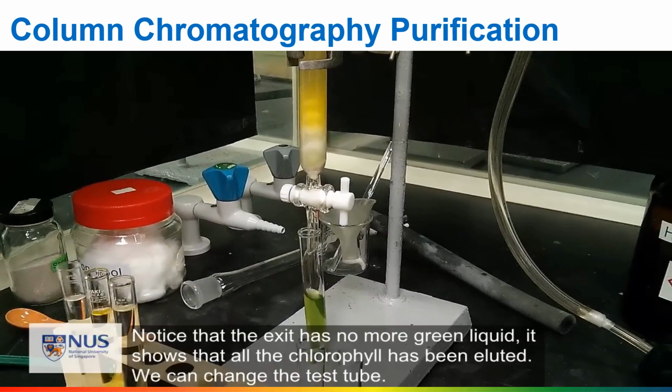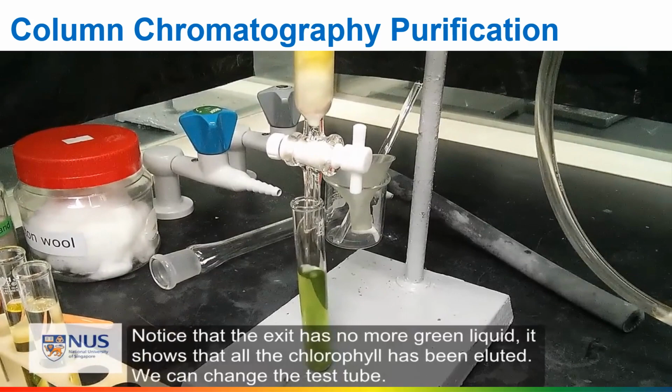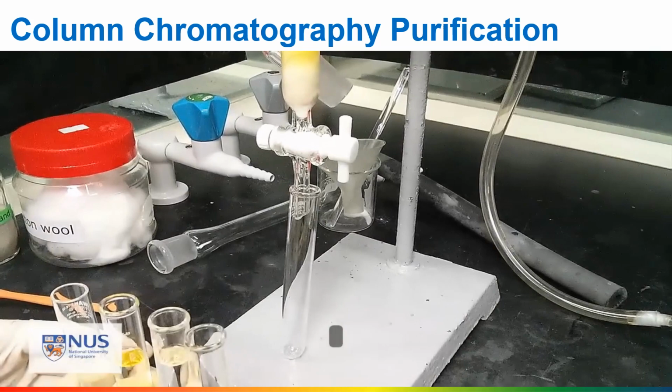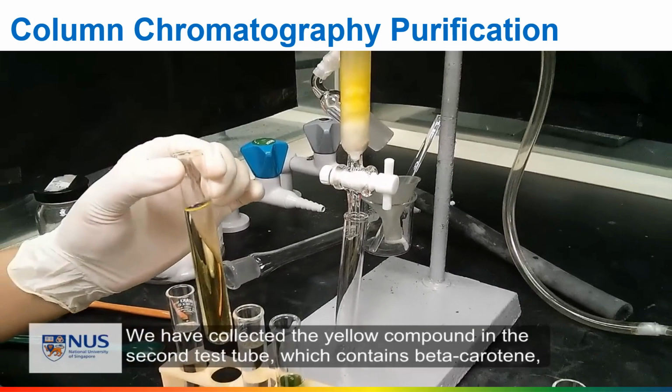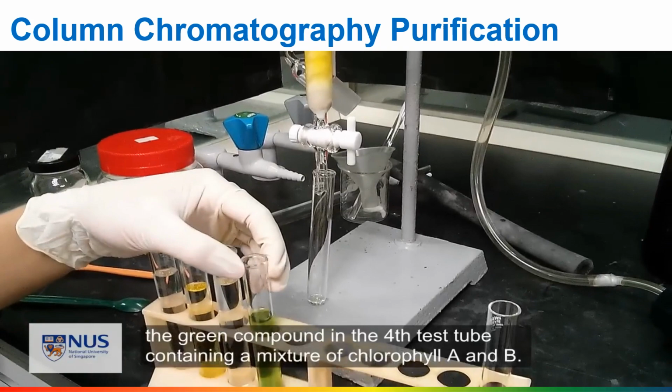Notice that the exit has no more green liquid. It shows that all the chlorophyll has been eluted. We can change the test tube. We collected the yellow compound in the second test tube, which contains beta-carotene, and the green compound in the fourth test tube containing a mixture of chlorophyll A and B. The first and the third test tubes are just solvents.